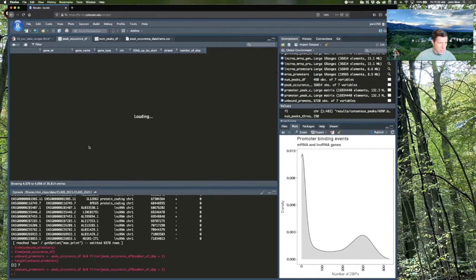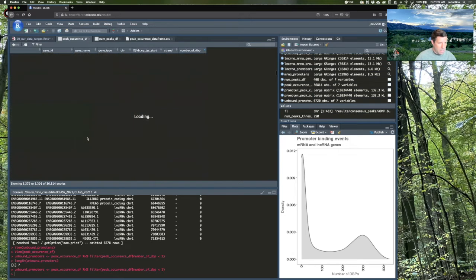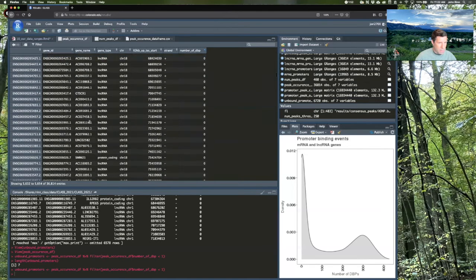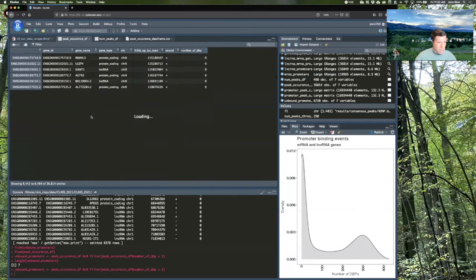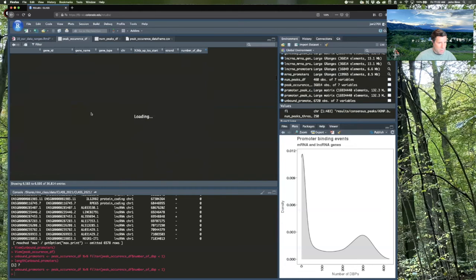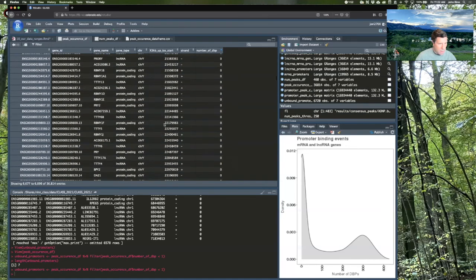So we'll try and get to 6,000 as fast as possible here. We're getting there. But it is good to spot check like this, as manual as it is. I'm sure there's a fancier way of doing this, but we got to get to 6,720, and we should start seeing numbers. We're just about there, and here we are, 6,720.